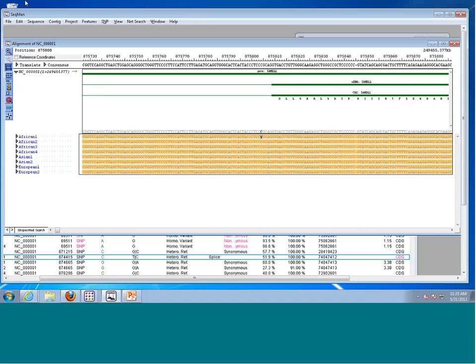So again, this is a multiple sample assembly. It's been multiplexed in Engine. And I can collapse things down, and now I have what we call a pseudo-consensus, and it will show me the differences, if there are any, in the aligned data. So I can see at this point, I've got a reference sequence that's a C, and one of the samples has an ambiguous call, has a variant call. And it's hard to see it, I think, in a webinar, but this is actually a green C. That tells me that that's an annotated SNP, and it has been present in dbSNP.